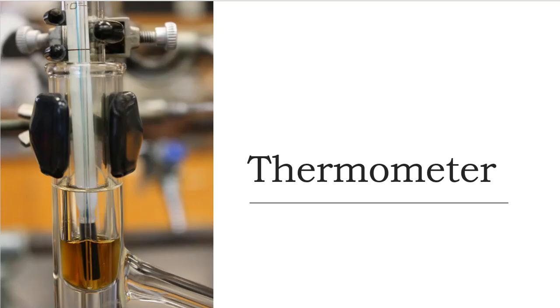All right, so here's the thermometer that's down inside of that test tube with the capillary tube and the unknown alcohol. One of the things I wanted you to keep in mind, this is what I don't like about our crappy, nasty thermometers. Number one, it doesn't cover the bulb, does it? But this is all the product that I had. I didn't have any more.